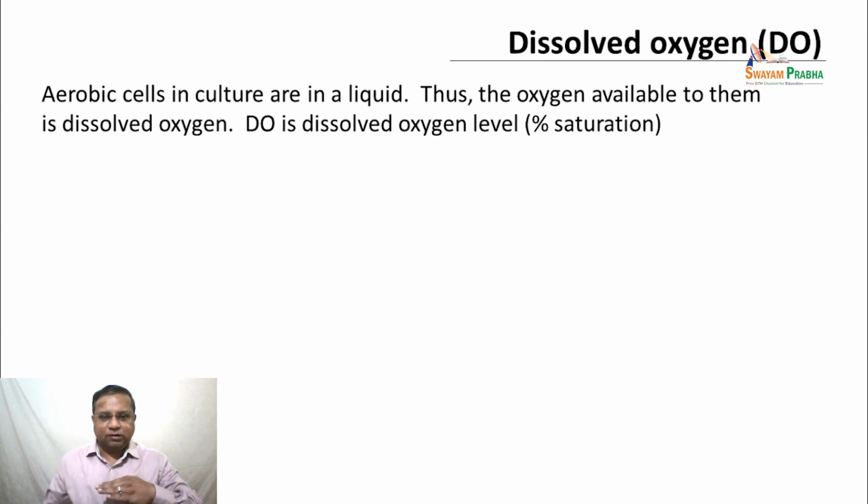Right? So, oxygen is partitioning at equilibrium. You have a certain relationship between the dissolved oxygen concentration in the liquid and the concentration of oxygen in the air, given in different units. Now, when it is saturated with air oxygen, you have a certain amount of oxygen in the liquid. If you change the gas phase composition, of course, the equilibrium concentration in the liquid is going to change.